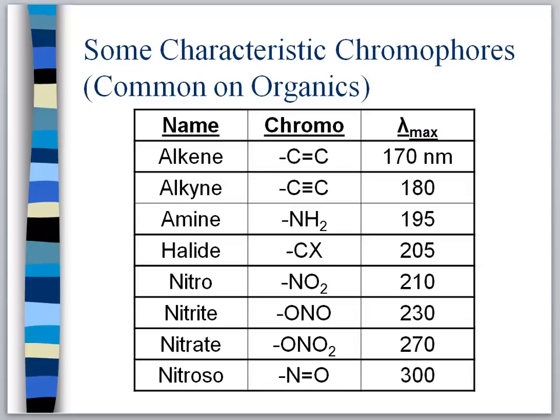And then we said that if a molecule is colored or a solution is colored, that colored solution could probably be run on a UV Vis spectrometer. And I would dial in to a different range, and I could probably measure and get quantitative data based on that as well.